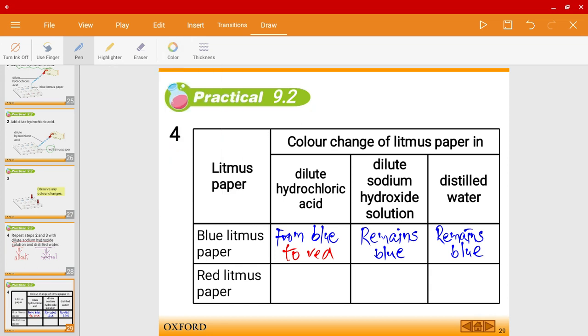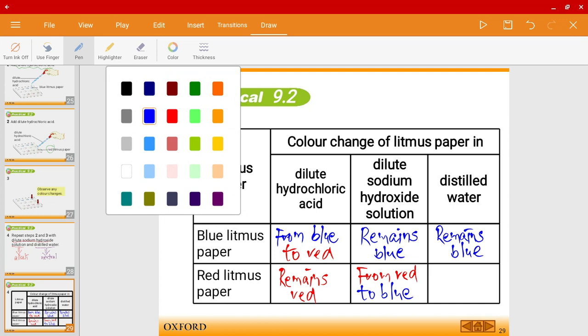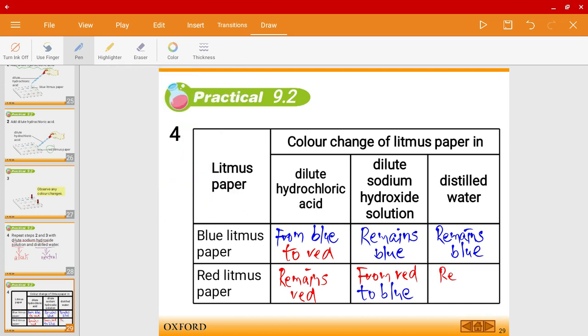Now for red litmus paper: with dilute hydrochloric acid, it remains red. With dilute sodium hydroxide solution, the color changes from red to blue. And for distilled water, it remains red.